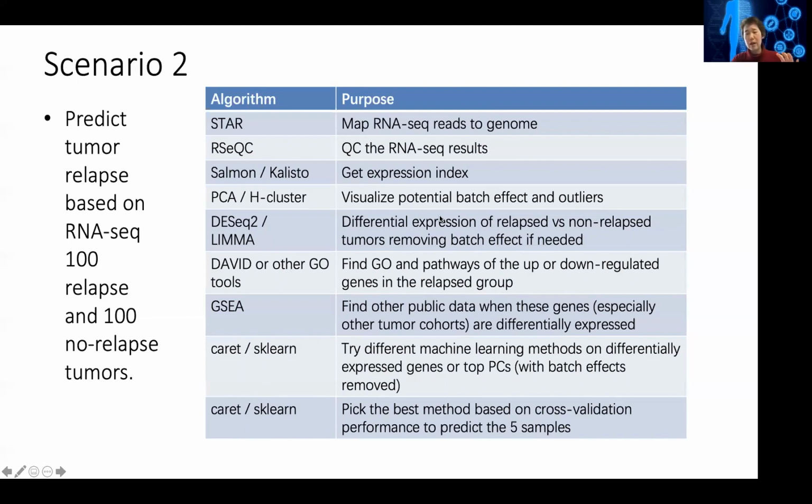This is a general trend of a group of genes. This is a general trend of another group of genes. And k-means is actually used a lot more. They have very different purposes. PCA just projects data onto 2 dimensions, but with k-means you usually use a heat map to visualize it. So yes, they are both clustering, but they are quite different as well.